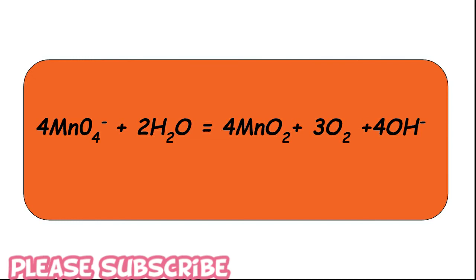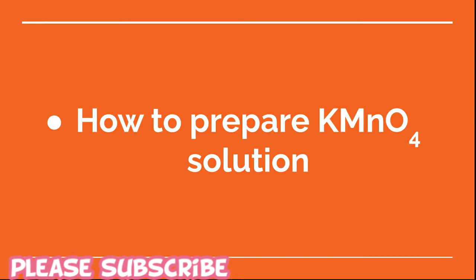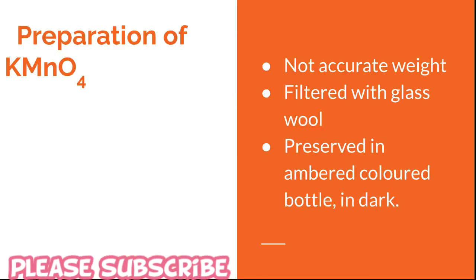So let's come to our next point, how to prepare KMnO4 solution. As we mentioned before, KMnO4 cannot be prepared accurately because of contamination of MnO2. So we need to take some extra amount of KMnO4 and then standardize it to get the perfect strength.